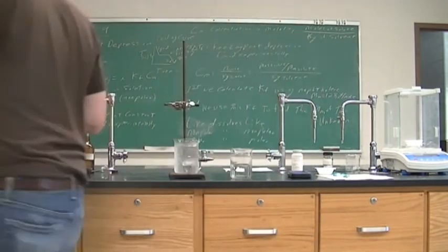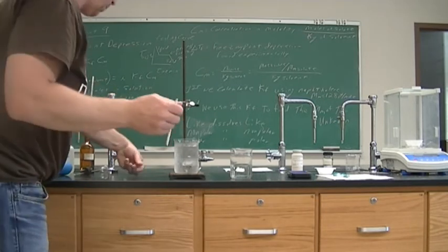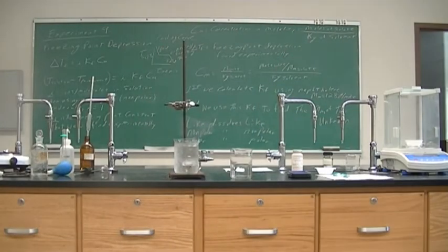Now we're going to take another sample and do the unknown.